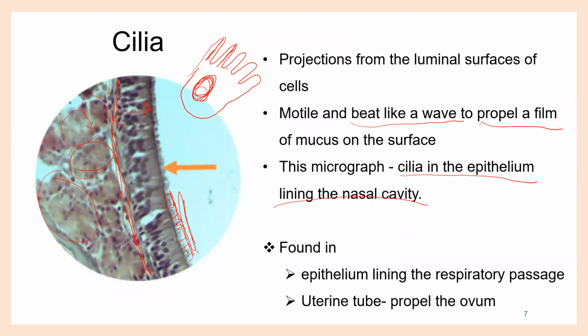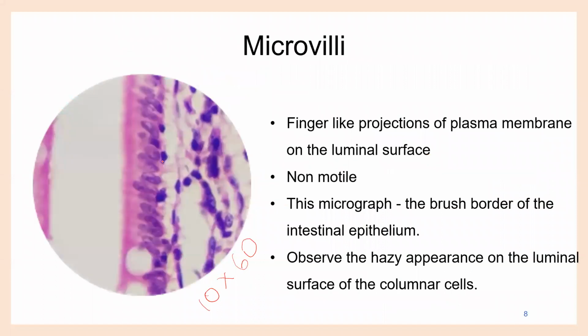So it has a skeleton, and that is why it is motile. There's a base also where it is stuck to the base like this. Because of the specific structure with several filaments going up the cytoplasm lining, the cilia have motility. The filaments are in the middle, and they are quite long.